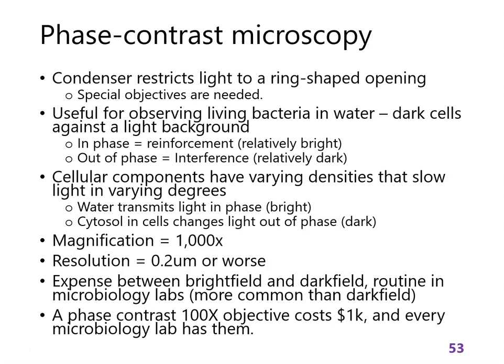Phase contrast microscopy can go up to 1000x magnification. So that is a 100x phase contrast objective with a 10x ocular, and this is common. A lot of microscopes in teaching labs have them. A lot of times the scopes you use for histology will have been purchased to be both for histology and microbiology, so you'll actually see that you have phase contrast objective lenses. They are more expensive than bright field, but they're less expensive than dark field. So these are routine.